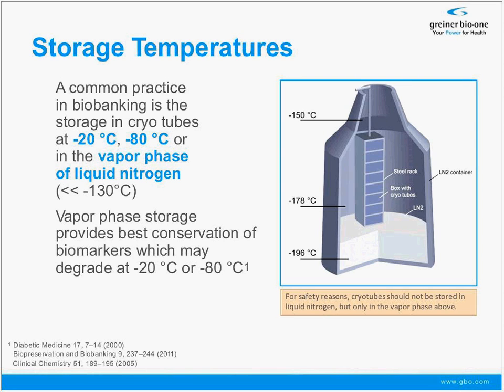What definitely should be avoided for liquid samples and also for frozen fresh tissue is storage at -20 or higher, because there would definitely be alteration of your samples. An exception at this stage is paraffin blocks with tissue in them, which can be stored at room temperature, but this is a rather rare situation in biobanking.